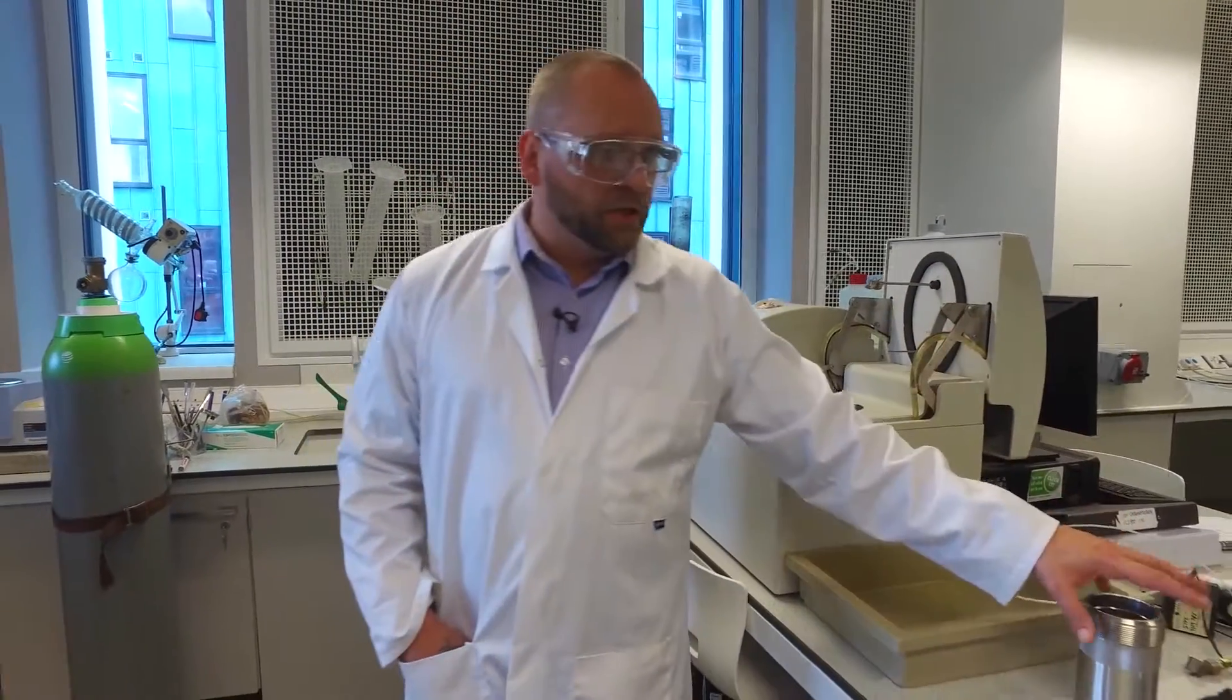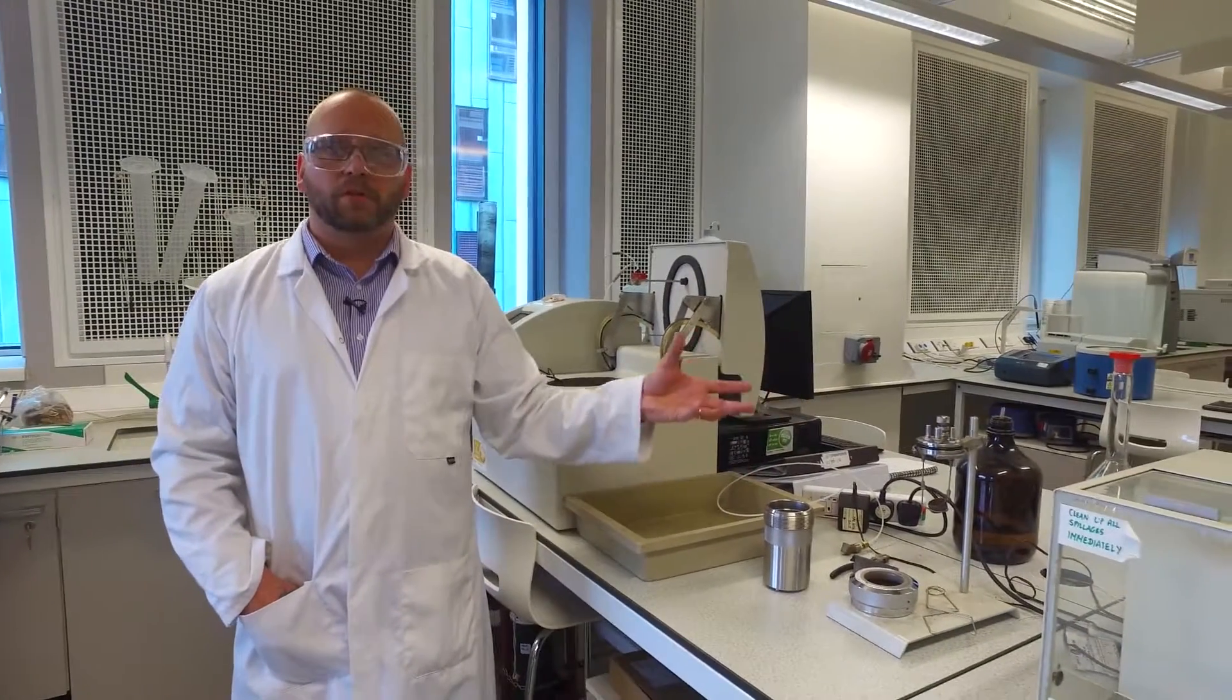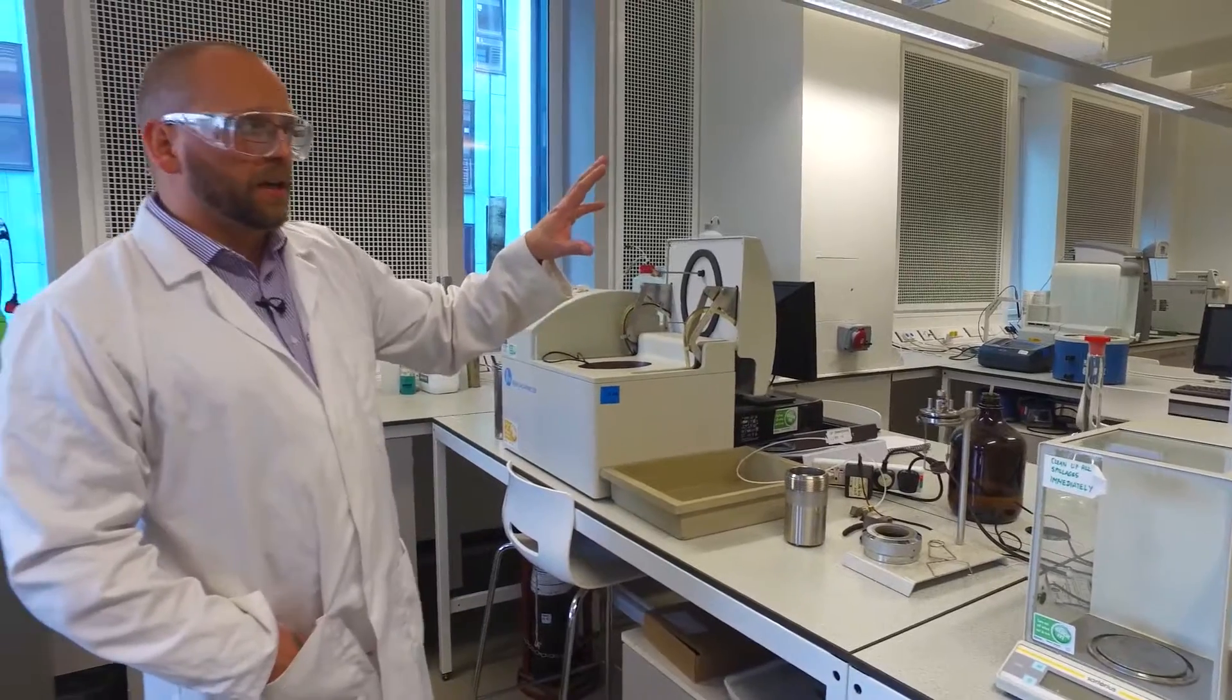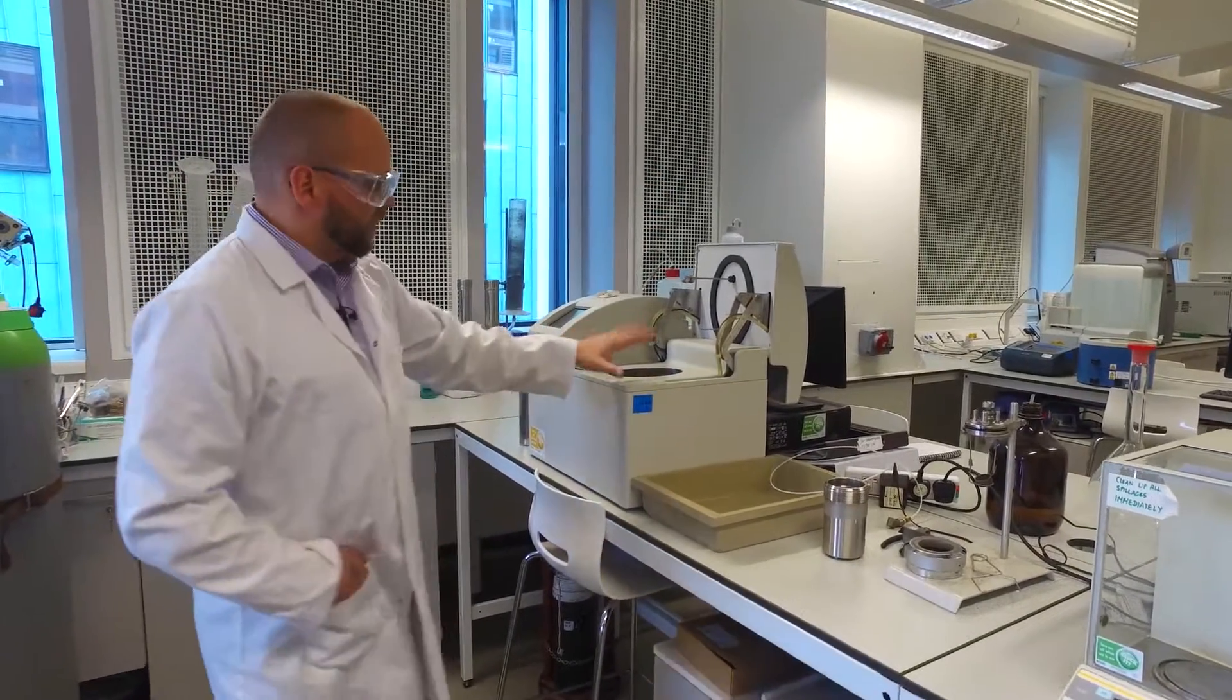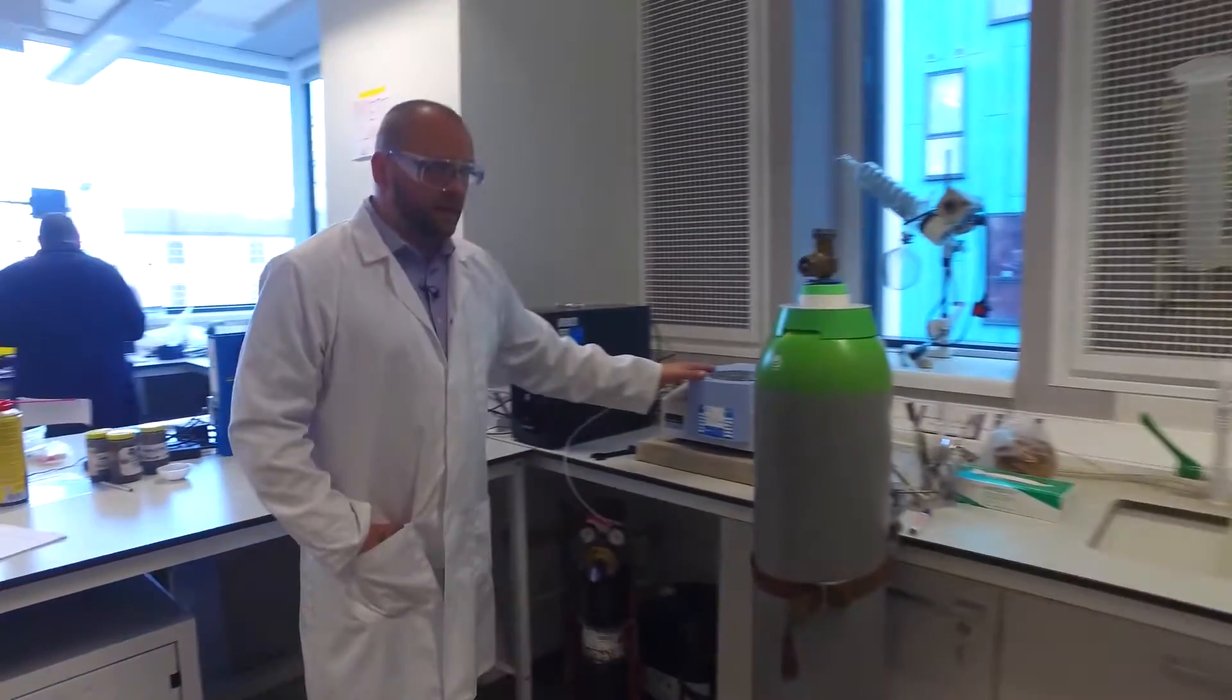What I wanted to show you with this through these labs is how these systems can be linked together. For example, from the bomb calorimeter we move over here to the thermogravimetric analysis.